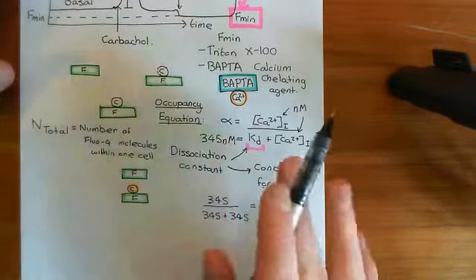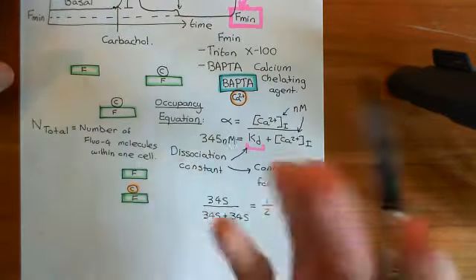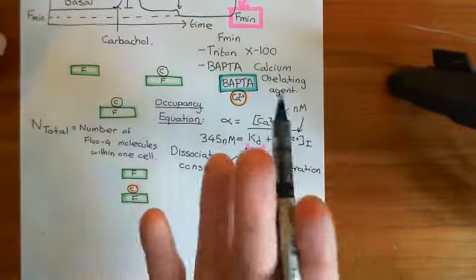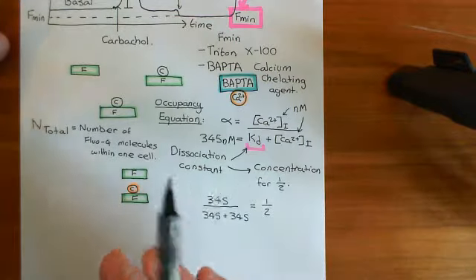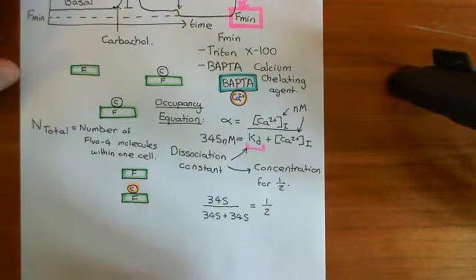So we can just work out the occupancy in one cell, and say that it's the same in all of the cells. Then we've got the occupancy of Fluo-4 molecules within our well, because we're assuming all the Fluo-4 molecules are inside the cells.